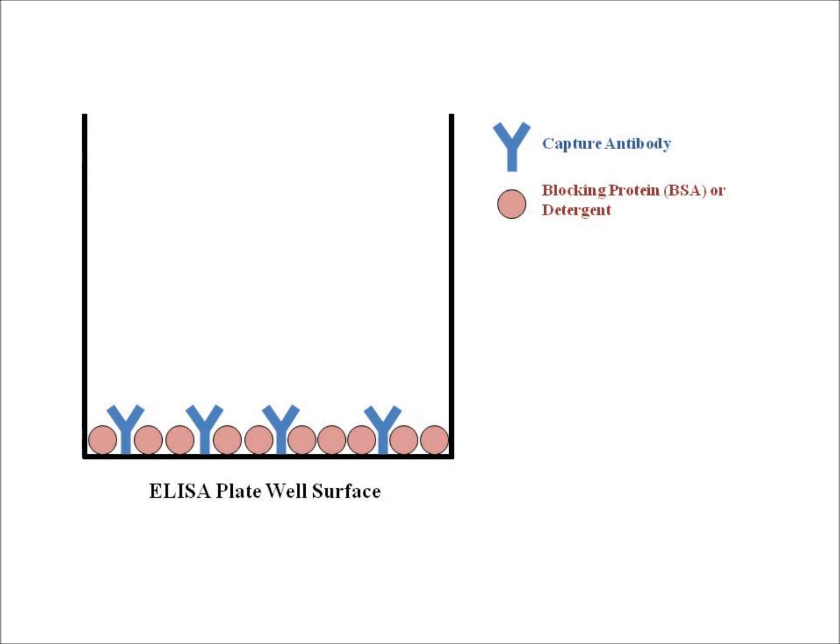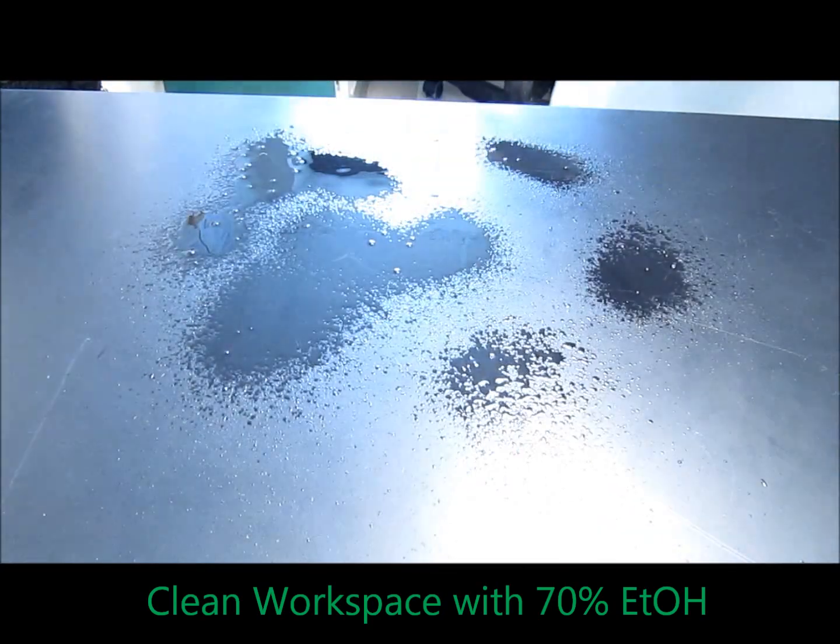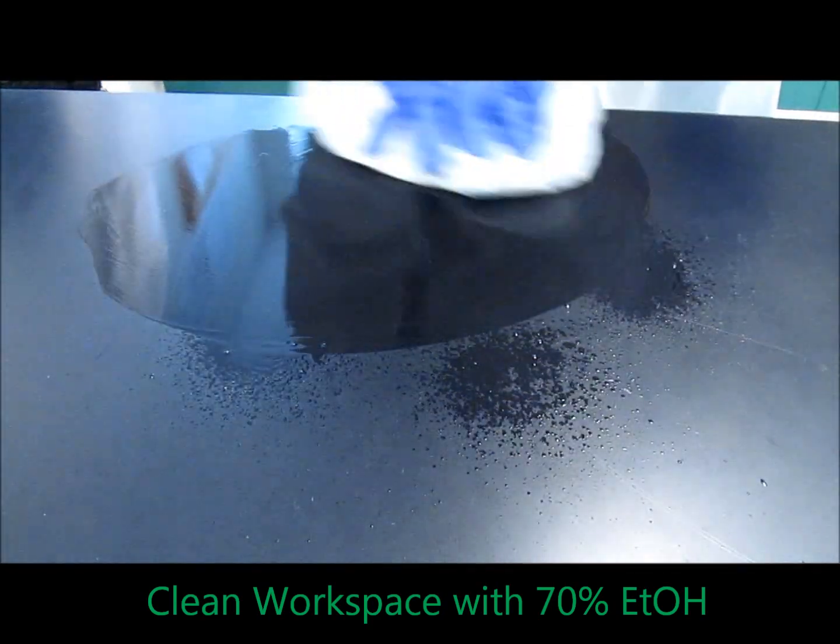Let's jump right into it. The first thing you want to do is spray your surface with ethanol and wipe it with a Kim wipe or a paper towel to make sure that you're working on a clean surface.